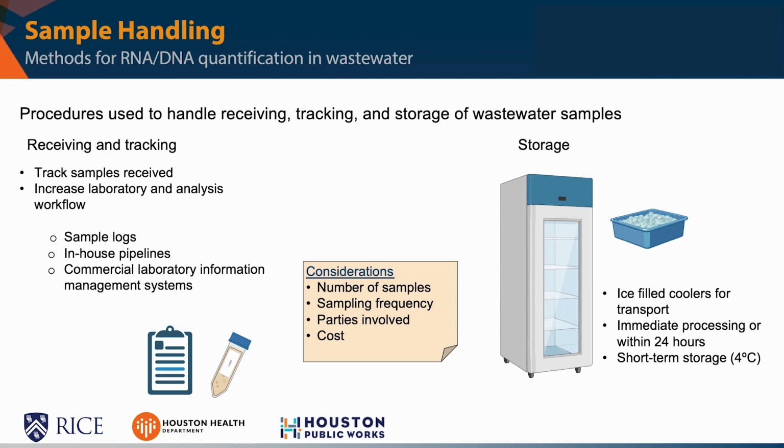Sample storage is another aspect of sample handling. Proper storage is critical to ensure sample preservation. Samples are usually transported to laboratory facilities on ice. Specifically for SARS-CoV-2, the CDC recommends storing samples at a temperature of 4 degrees Celsius immediately upon arrival and processing them within 24 hours to avoid degradation.